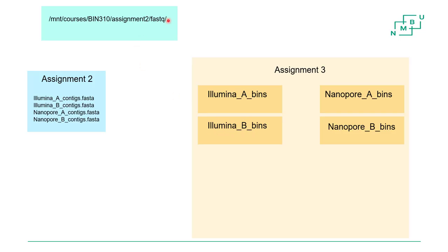And if you take the reads from a different sample up here and map, the results mean nothing, right? It's a complete waste of effort, really. At least for this context, they mean nothing. They may mean something in another context, but here you have to make sure that you map the reads from the same sample as you have contigs from all the time.